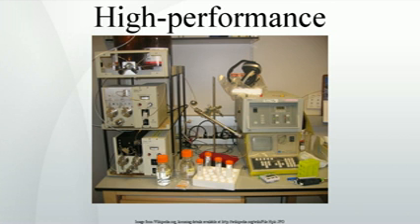HPLC has been used for medical, for example detecting vitamin D levels in blood serum, legal, for example detecting performance enhancement drugs in urine, research, for example separating the components of a complex biological sample, or of similar synthetic chemicals from each other, and manufacturing, for example during the production process of pharmaceutical and biological products, purposes.